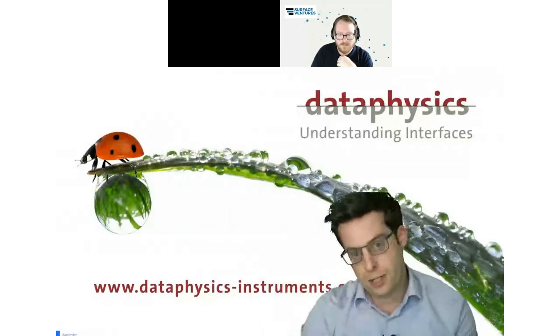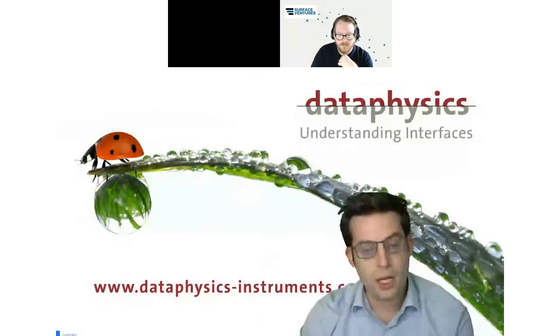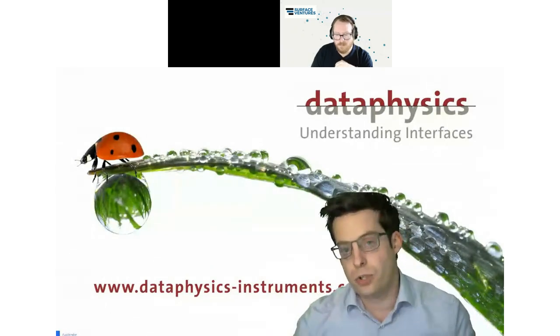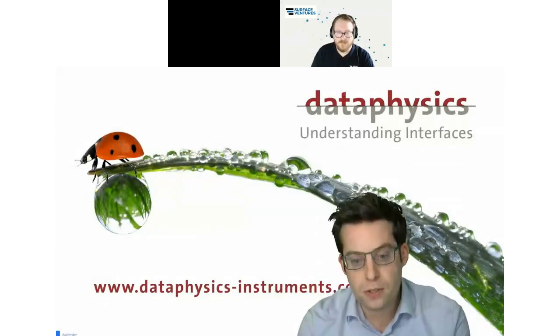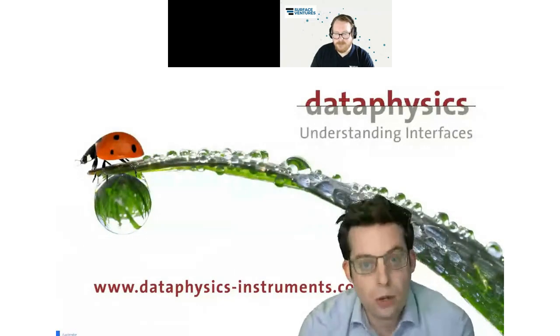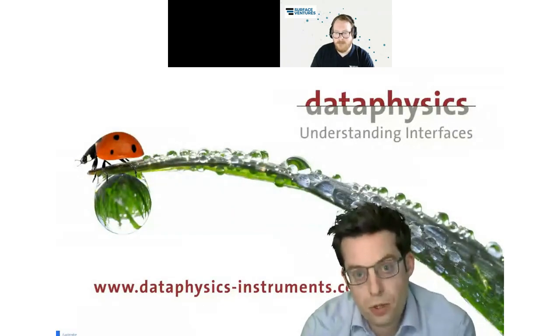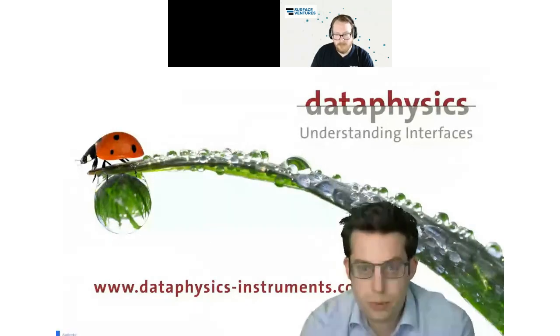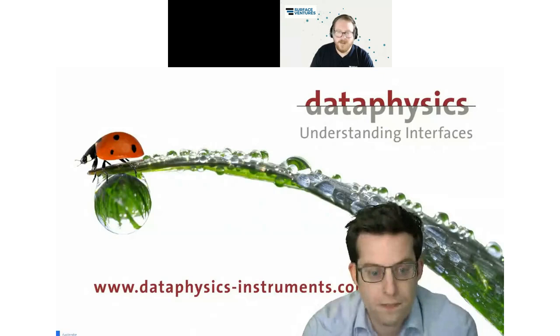But if you did an adhesive force measurement for these two, you would see a difference by a factor of 2 or even higher in the adhesive force. So from my side, if you have very hydrophobic surfaces, go for adhesive force measurements if you still want to quantify differences, and don't use contact angle measurements. And for all below, go for the contact angles.